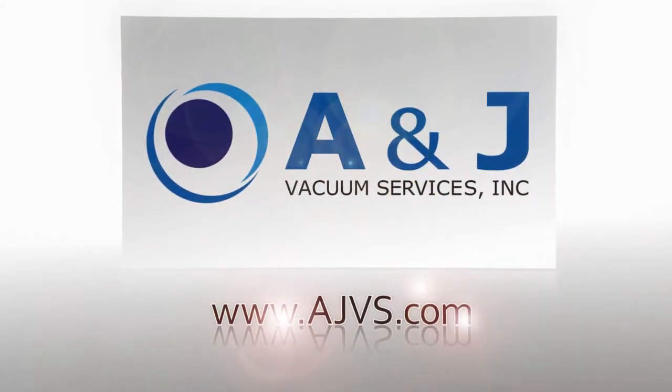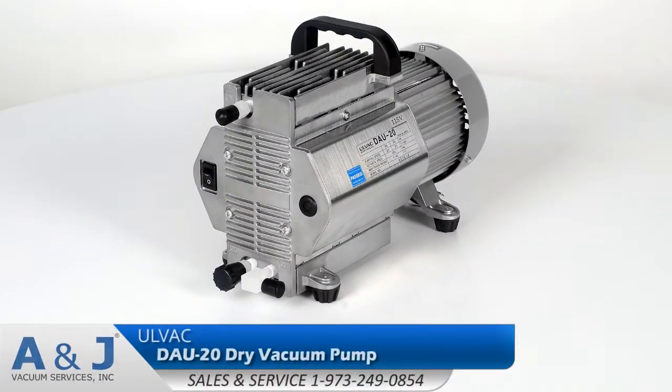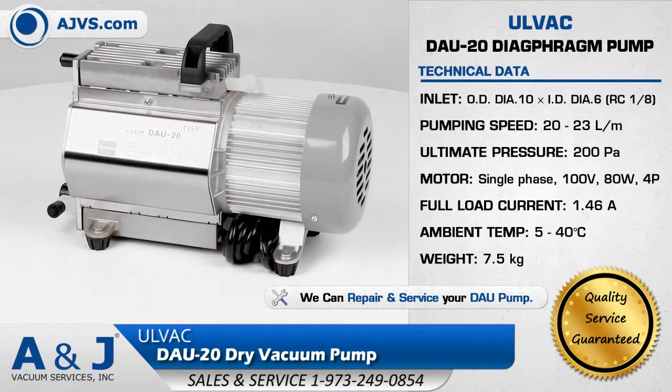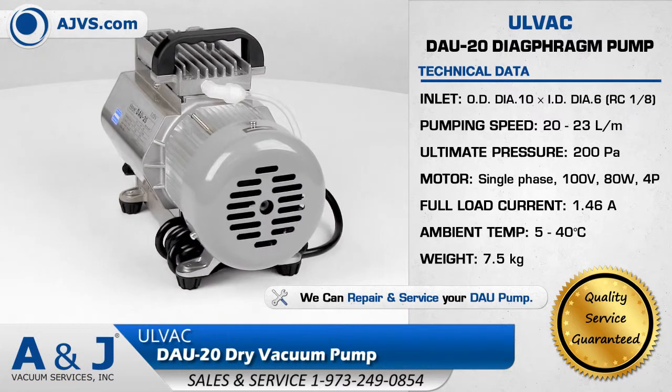AJVS.com, your worldwide leader of high vacuum equipment. The Olvac DAU Diaphragm Pump Series features exceptional pumping capability, superior vacuum performance, and state-of-the-art design features.